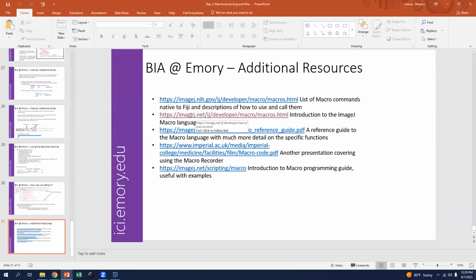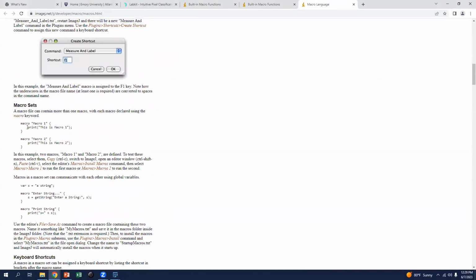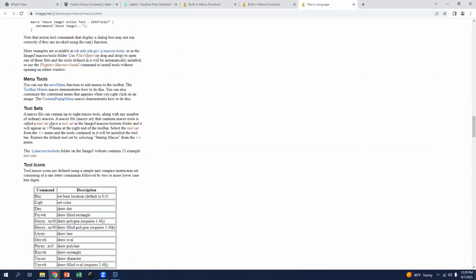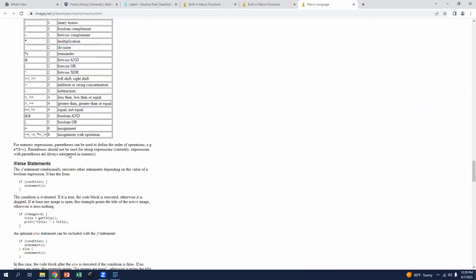This page here, the second link, actually covers some examples of how to write macros and how to use the different types of loops, for loops, while loops, etc. And that is a little bit more advanced than what we can cover today, but it is very important for creating iterative loops or statements. If you want to go through 1,000 data files, you're probably going to have at least one loop in there.